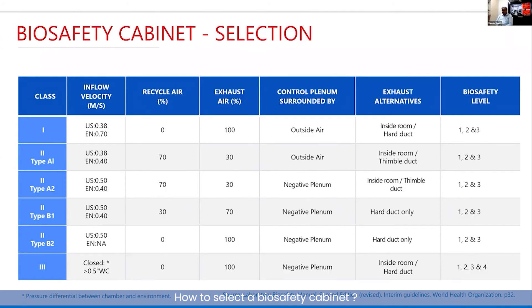In the case of Class 3, it is a completely closed system. The chamber is negative with respect to the outside and 100 percent of the exhaust goes through HEPA filters with proper treatment — sometimes double HEPA filters or a HEPA filter followed by a scrubber. Class 3 is recommended for biosafety level 4, whereas levels 1, 2, and 3 can use any of the other cabinets.